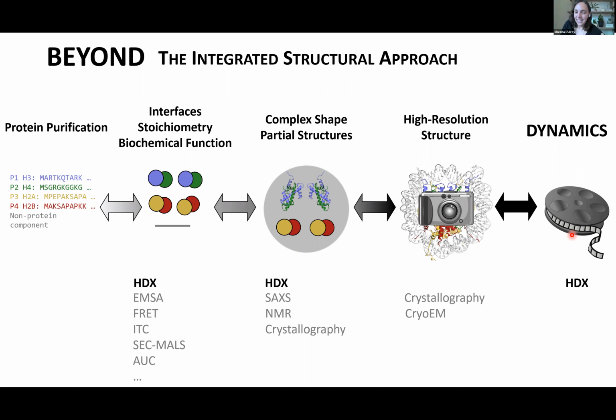And by dynamics, I use this term rather loosely. I'm talking about the stability of a protein's conformation. I'm talking about how that protein might move in solution as particular variables are changed. And so while I'm only going to touch on one story that really highlights the importance of dynamics today, this is something that I think HDX is very unique in providing this type of information.